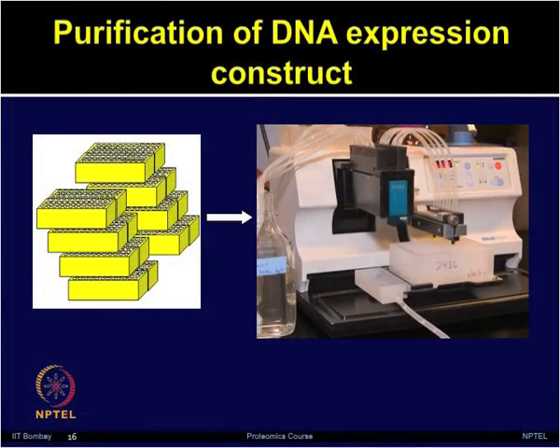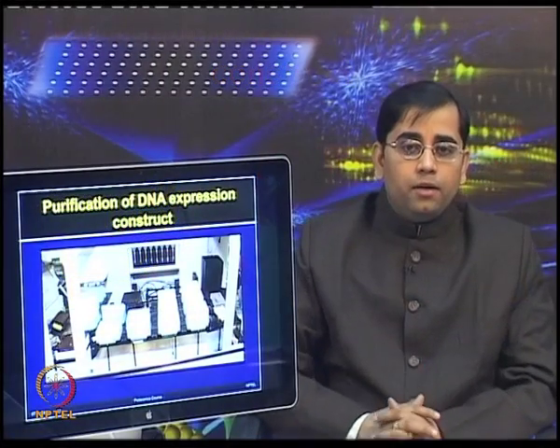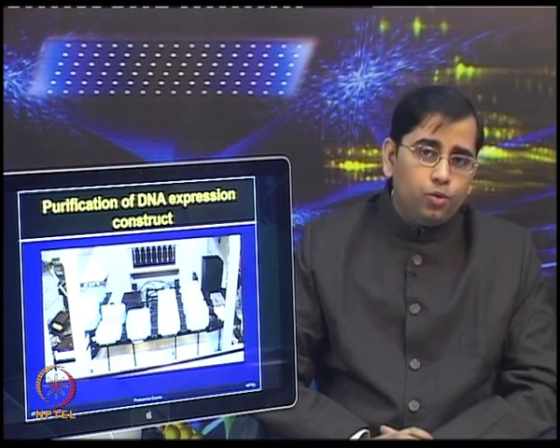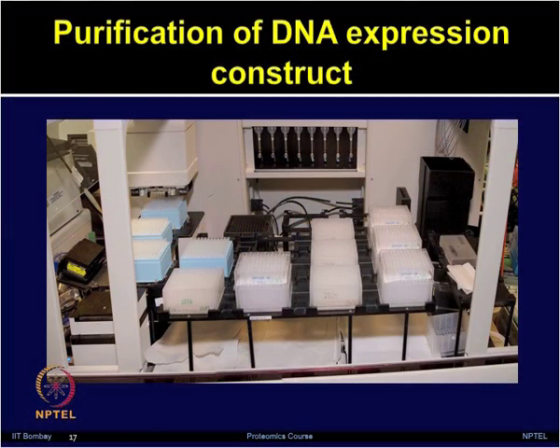So, a lot of these steps are automated by using different types of liquid handling systems. You can transfer the proper buffer solutions 1, 2, 3 by using different types of liquid handling systems and robotic platforms. Just an image here to show that different types of robotic arrays and platforms can be used for performing these experiments, so that you can do the prepping in 96 well plate format. Lysate can be loaded directly onto the DNA binding plates by using these robots.